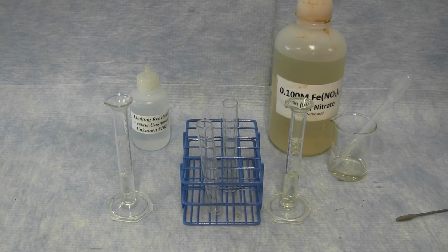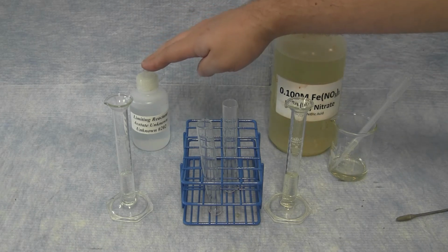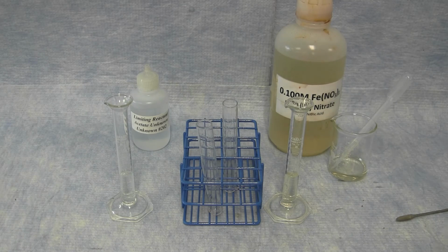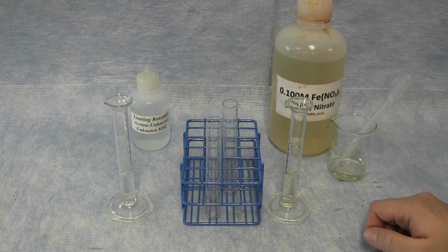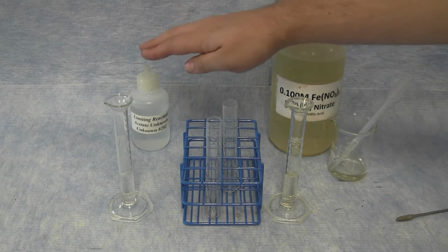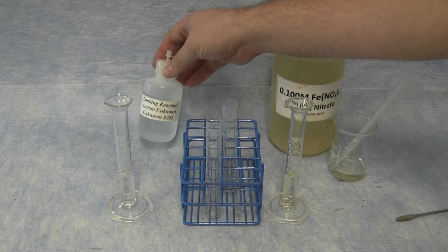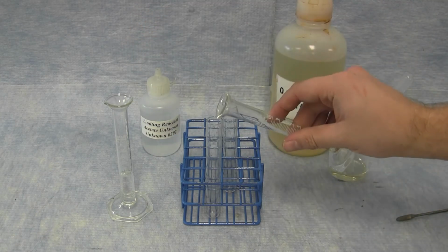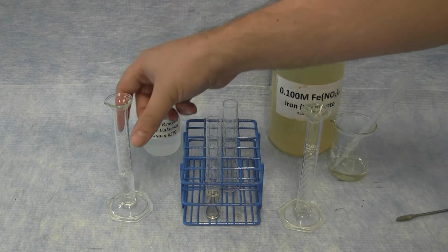The last reaction setup looks at the reaction between iron 3+ ions and acetate ions. As with the previous reactions, you'll be taking 5 milliliters of iron nitrate solution and your acetate unknown and combining those in a small test tube and recording your observations.